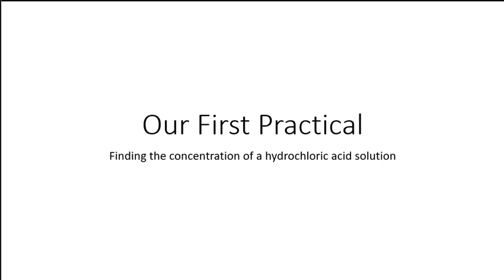Hello, in this presentation I'll be describing how our first practical should be conducted and going through some of the calculations. In this practical exercise we will be trying to find the concentration of a hydrochloric acid solution.